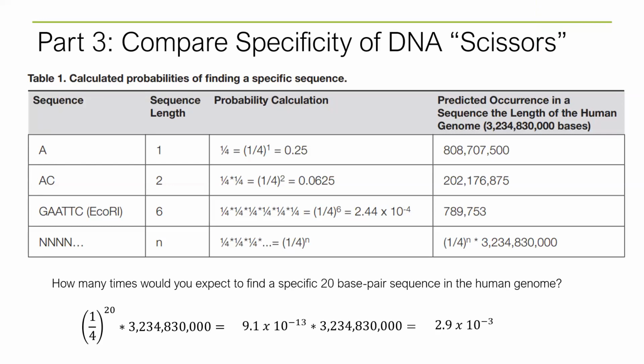So there is one question. Does the system tolerate any mismatches? Oh, I am not the expert on that, but I have read something that indicated that it might tolerate some. I guess you could probably think of this similar to primers with PCR, right? I don't really know the full answer to that though.